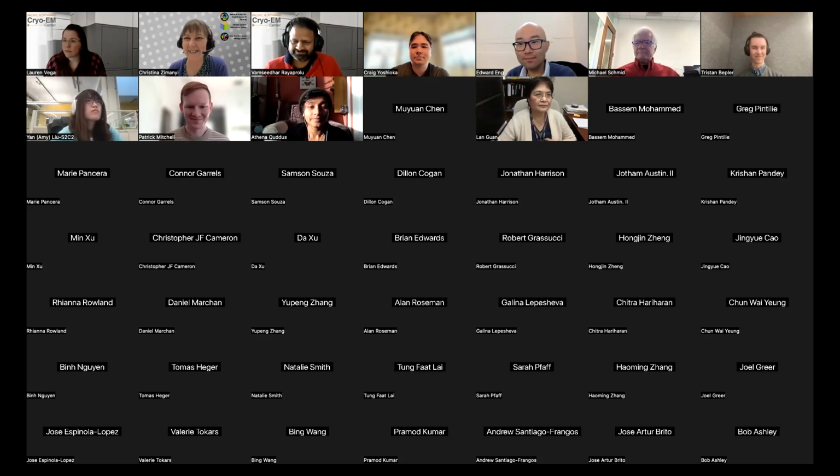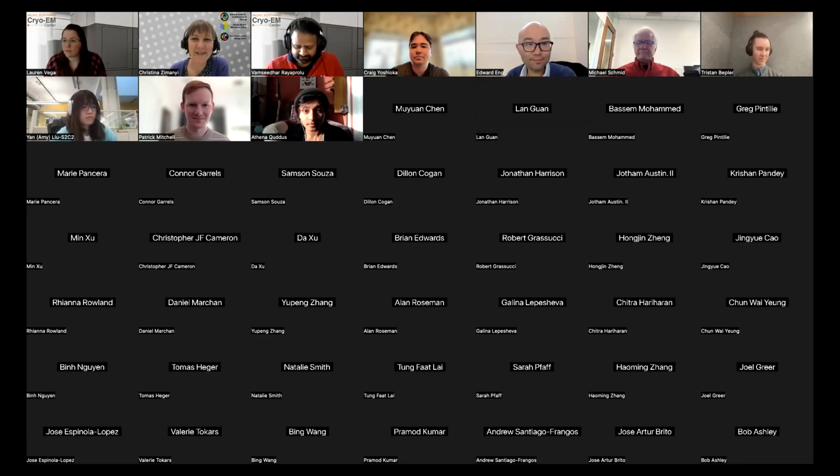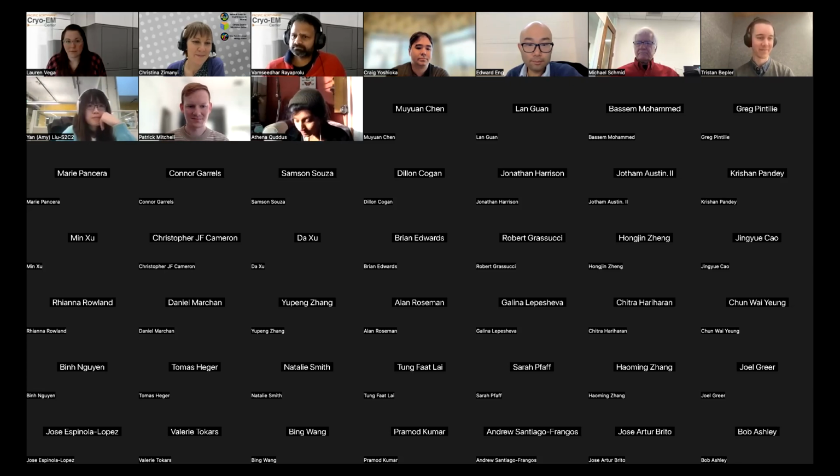All right, Tristan. Hey, yes, I'm Tristan. I'm the machine learning group leader at NYSBC. Before that, I was a PhD student at MIT. I developed Topaz, and Topaz is a neural net-based particle picker that uses positive unlabeled learning. Yeah, thanks for inviting me.